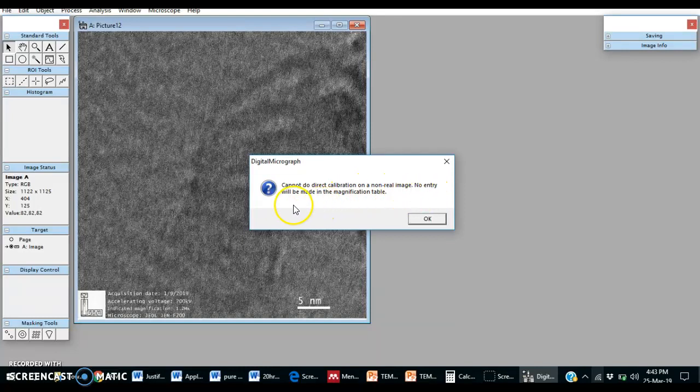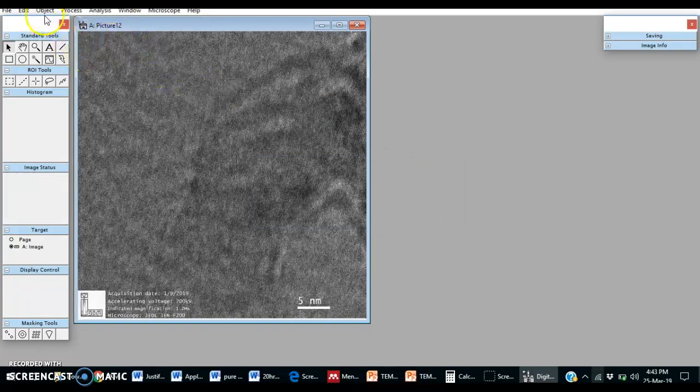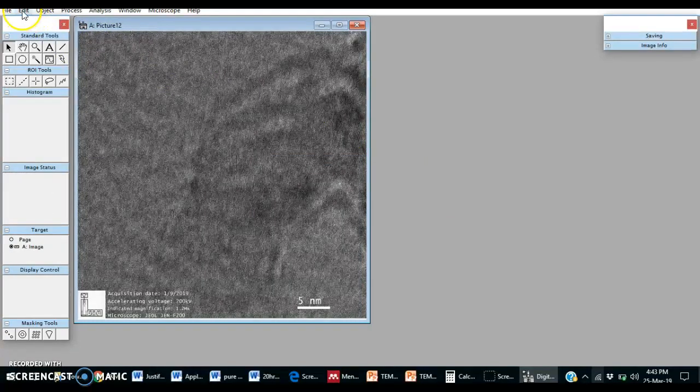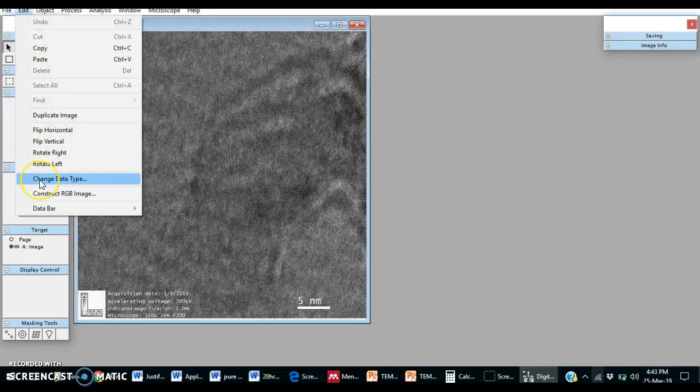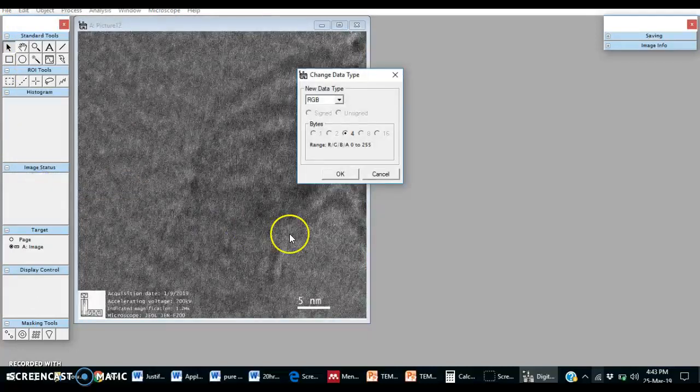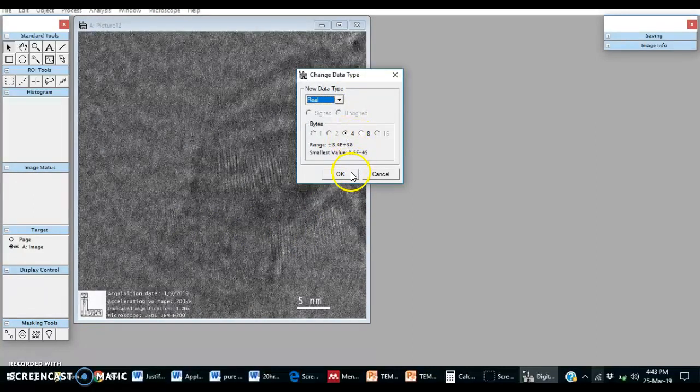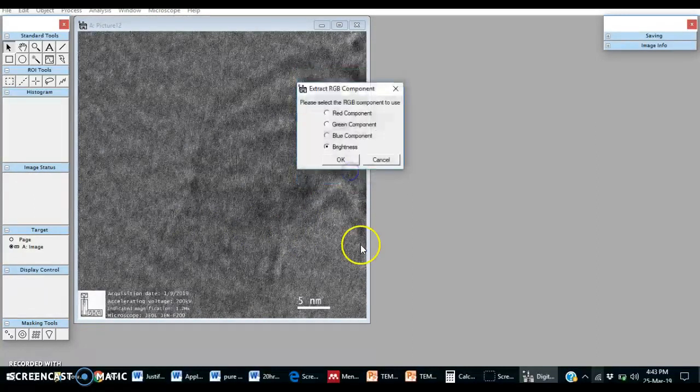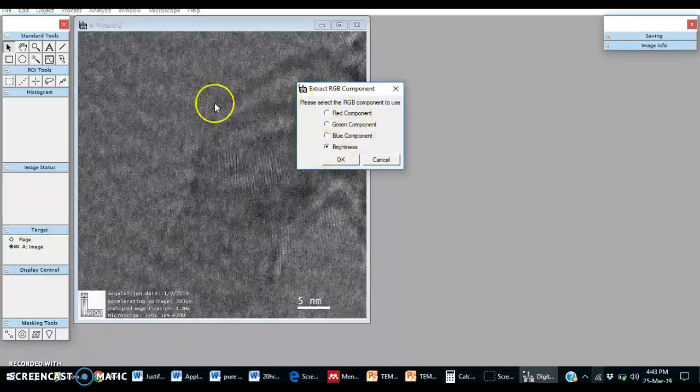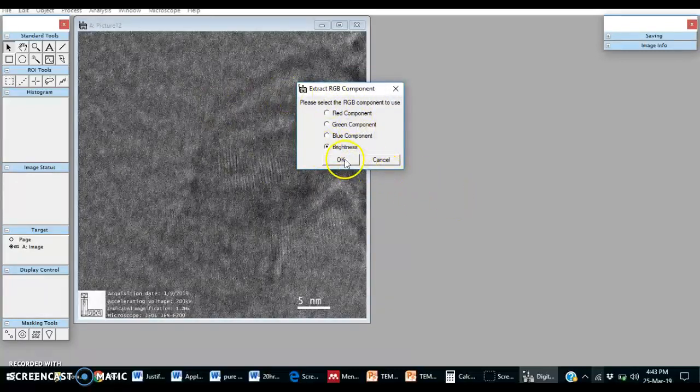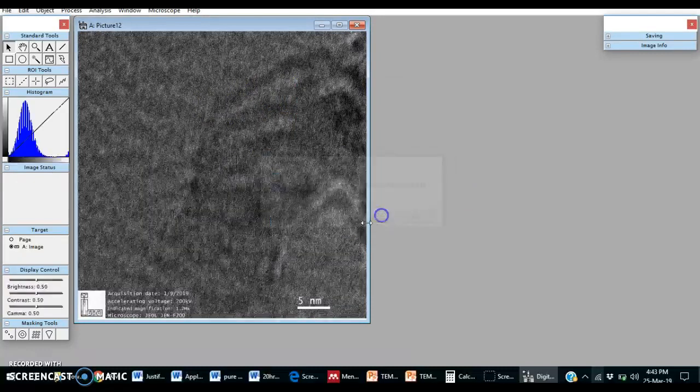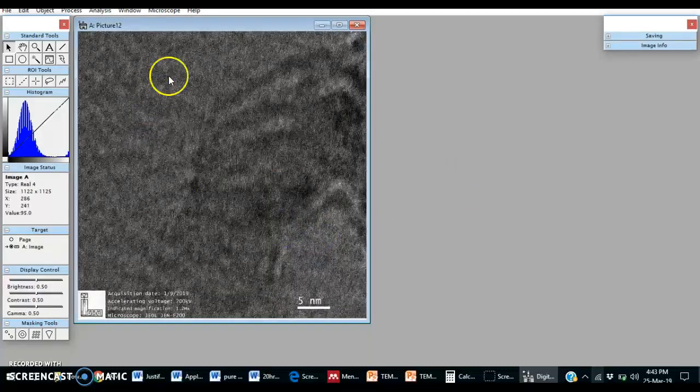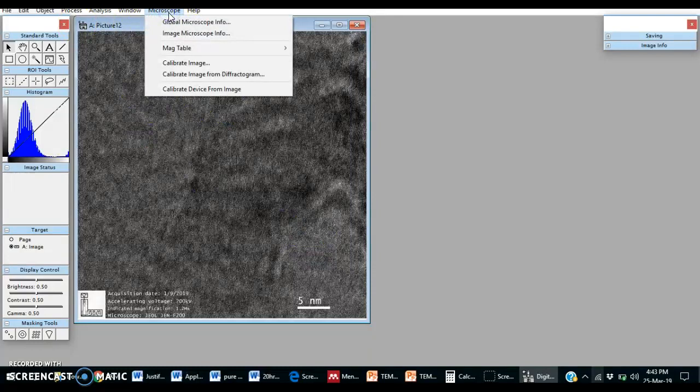So what we can do, we need to change data type. Make it real and here force white, then okay. Then it will change its brightness. Now we can calibrate this image.